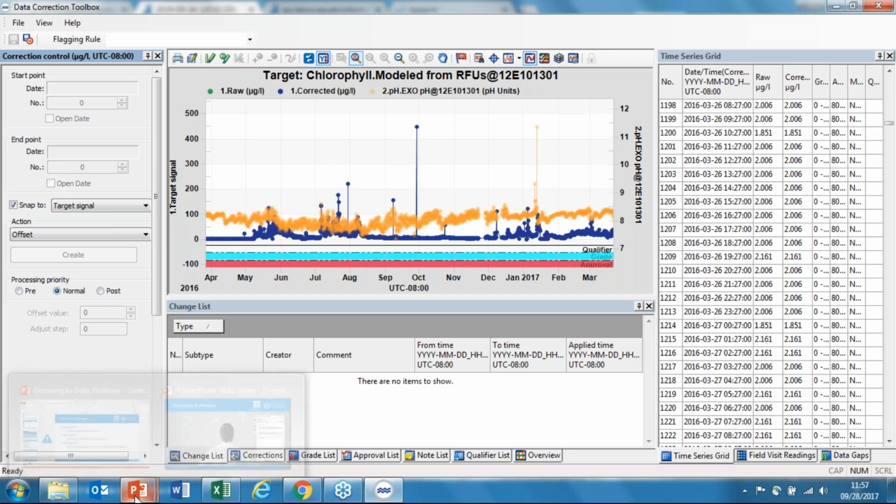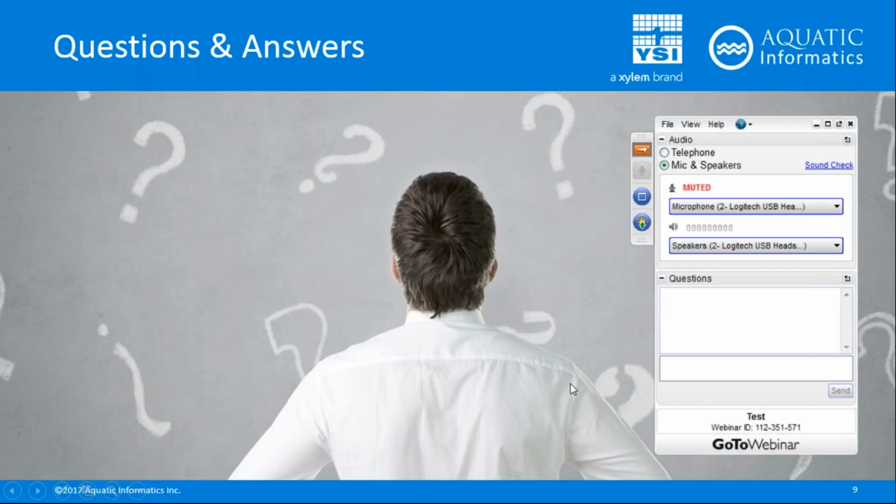Thanks for that, Chuck. Stephanie, this is one I'm not sure if you have off the top of your head, but it may have been in your diagram. What wavelength does phycocyanin emit? Do you happen to know that one? Let me think for a minute. It actually emits a range of wavelengths that are in the high 600s. I don't remember what the exact peak is, to be quite honest. I have another slide of that, though, and would be happy to email that out.